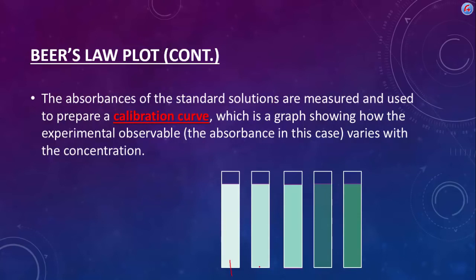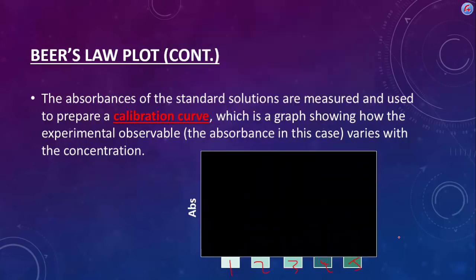So again, this was 1 molar, 2 molar, 3, 4, 5 molar that we made perhaps. Then we measure their absorbances, and their absorbances are this, this, this, and this. So their absorbances went up, up, up, up, and up. Once you have them plotted, you can put a straight line on that, a best fit line, if you will. That best fit line corresponds to our absorbance equation, A equals abc, where absorbance is the y-axis. On the x-axis is our concentration. And this component right here is the cell path length, and that's going to be the slope.